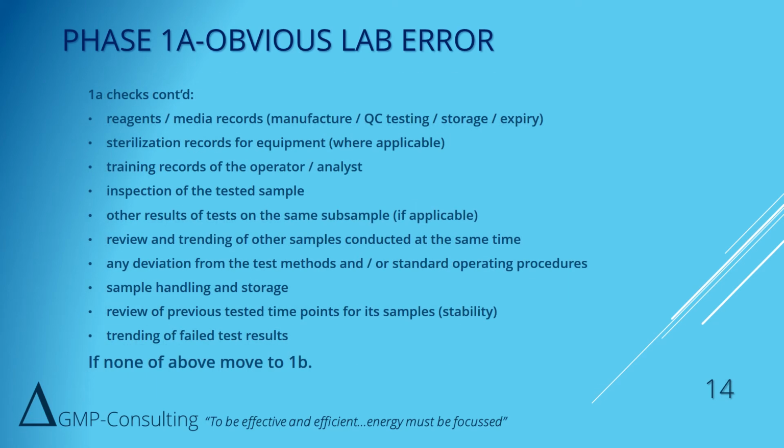This slide simply shows more examples of the obvious laboratory errors you could look for in the initial investigation.